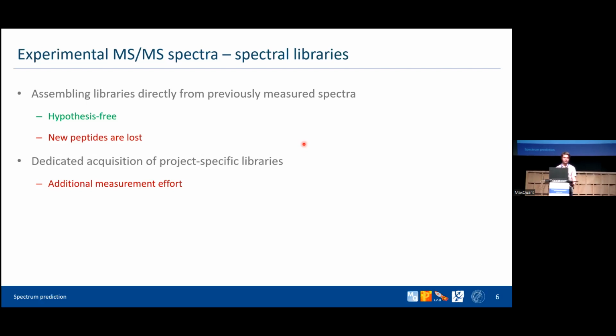One example of such a thing is DIA proteomics, because in DIA, due to many co-fragmentations, the additional information from spectral libraries is particularly beneficial for untangling the contributions from different peptides.